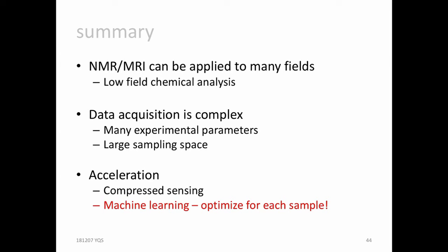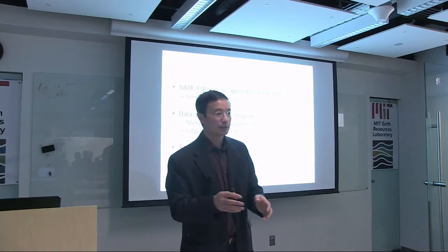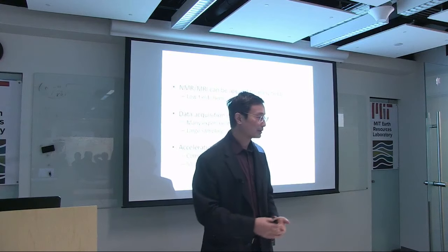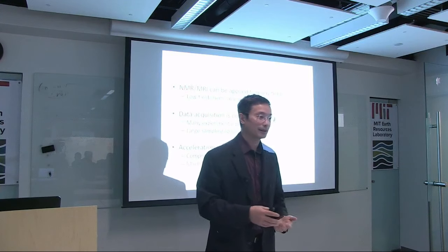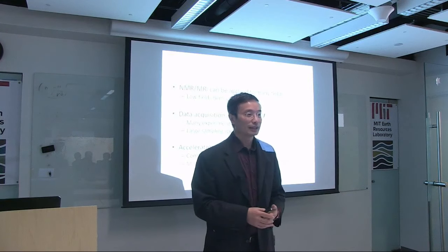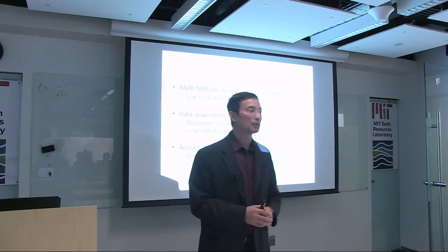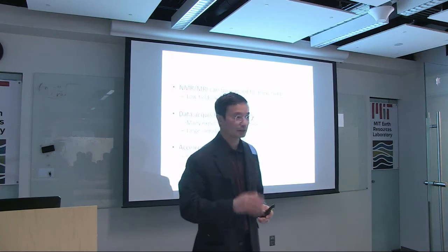But the one downside is that the NMR itself is complicated. In particular, there are a lot of parameters you can vary. So often it requires an expert. When you want to use the NMR service, you hire an expert or Schlumberger sends someone over, talks to you and sees how you should do it. That is very cumbersome, right? Most other measurements, you push a button, they will just do the measurement.